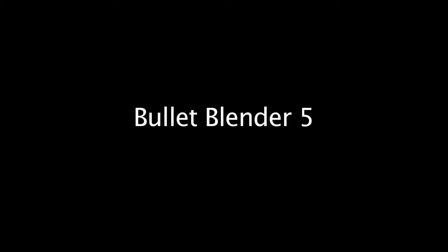The Bullet Blender 5 uses Axigen brand 5 milliliter self-standing tubes. When using these tubes, make sure that the cap is screwed on as tightly as possible.